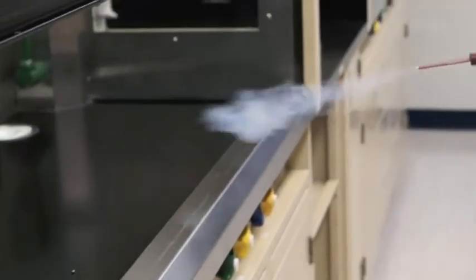The smoke pencil test procedure is the most comprehensive performance test for a fume hood. This test requires that a smoke pencil be used to visually show the ability of the hood to contain airborne materials.